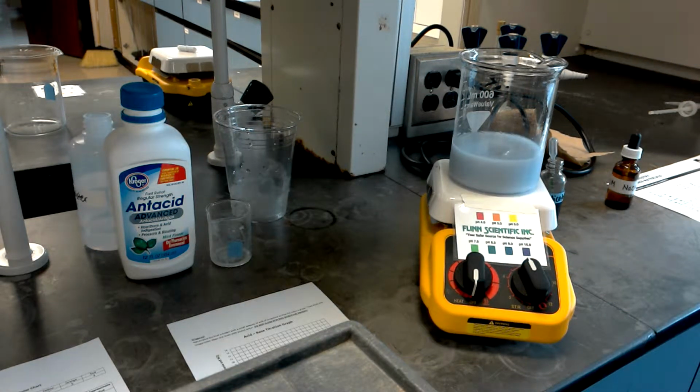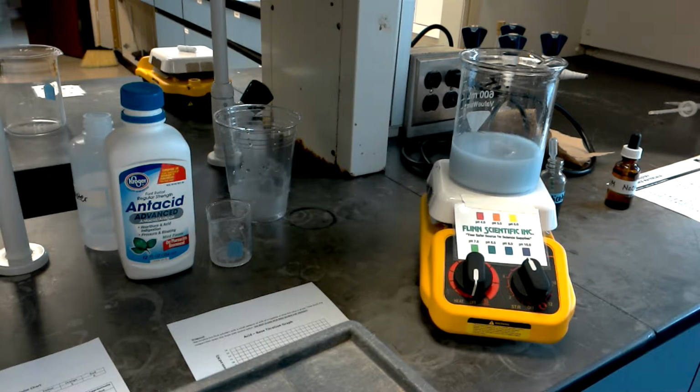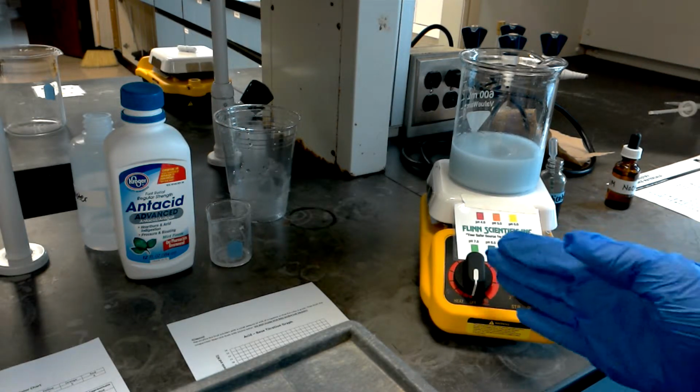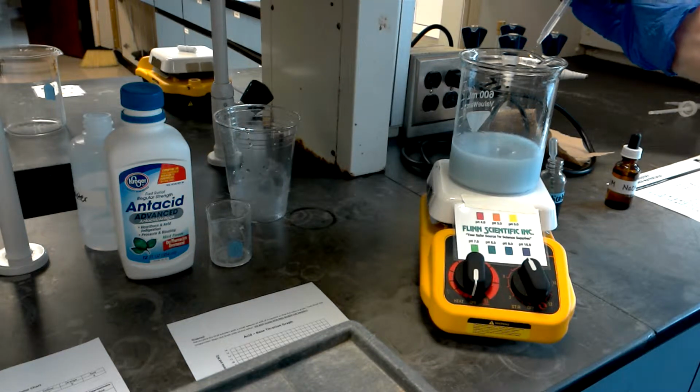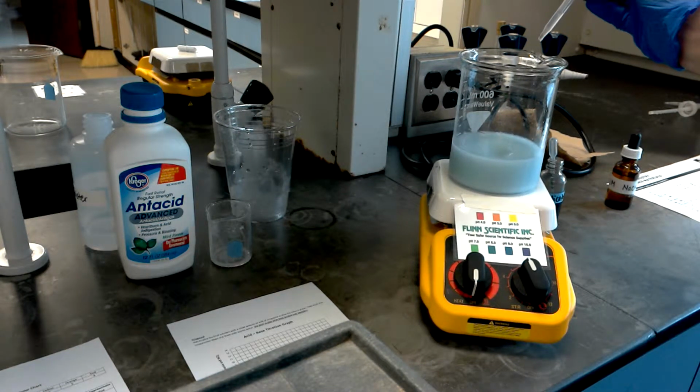12 drops, and we're actually moving towards the green, so you should have a pH of around 8 something. 14. 14 is closer to the pH of 7. 16 drops is again really close to 7. 18 drops.